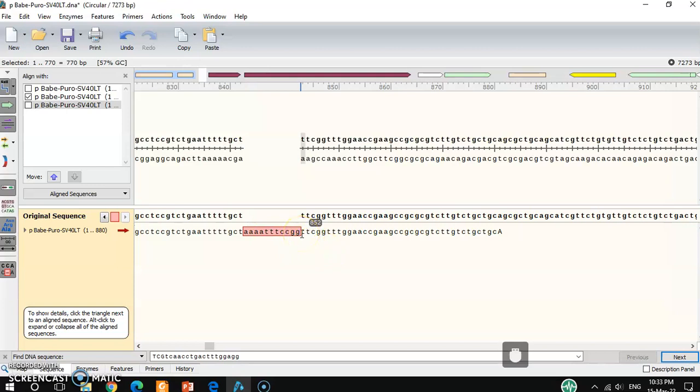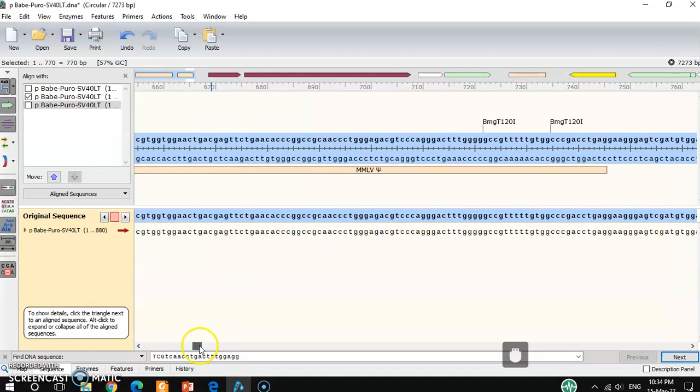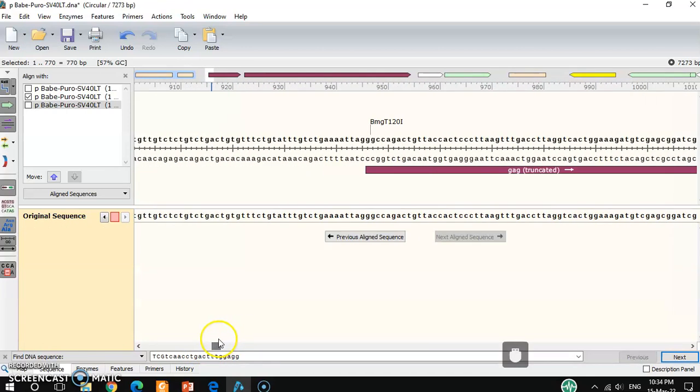This additional fragment is present in your copied sequence, but not present in your parent sequence, so that's what it is showing. If you detect this kind of thing, it means the sequence that you want to get has some additional fragment that is not present in your parent strand. So this is the additional fragment you detected.